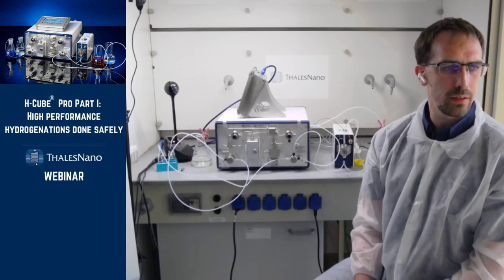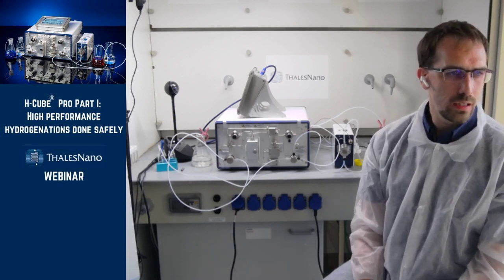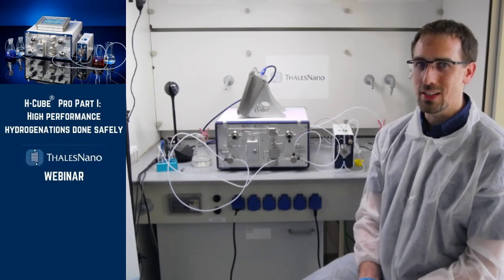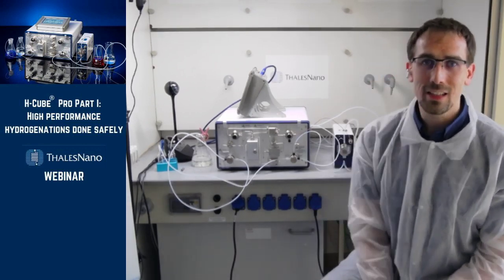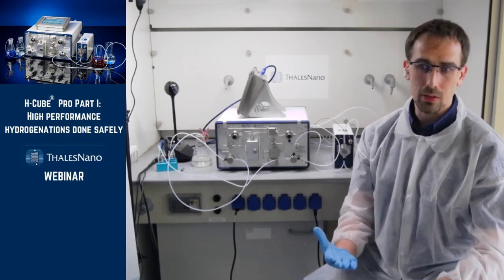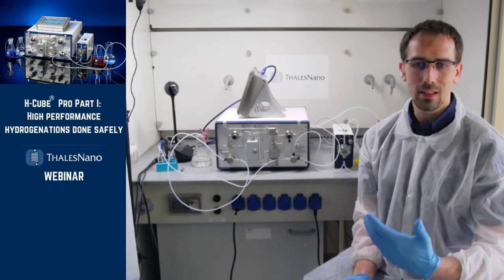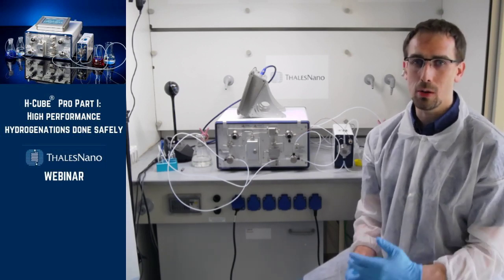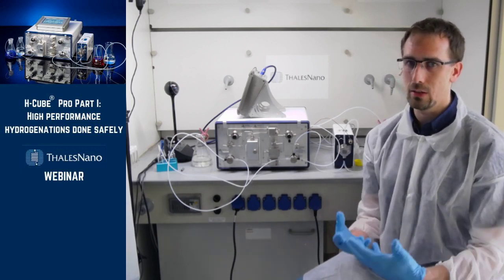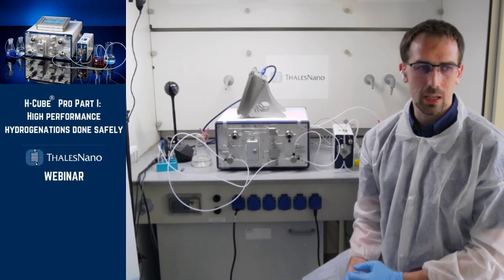For a 30 millimeter cartridge, what is the maximum sample used to perform a reaction? And in case of 70 millimeter, how much? Unfortunately, I don't have a general answer for that question. It again depends on the difficulty of the reaction to perform. In principle, if your catalyst activity doesn't drop during a process, you can use the 30 millimeter long or the 70 millimeter long, and you will see no difference in terms of lifetime. But that would be quite a rare occasion.